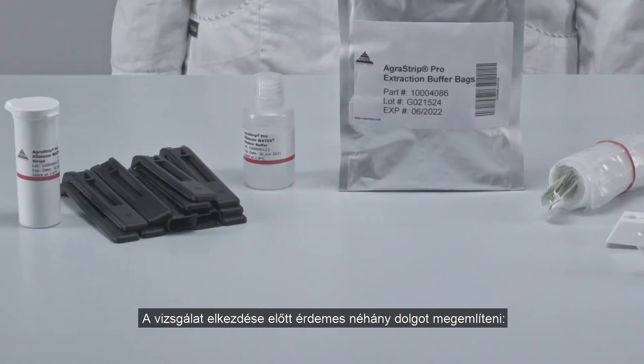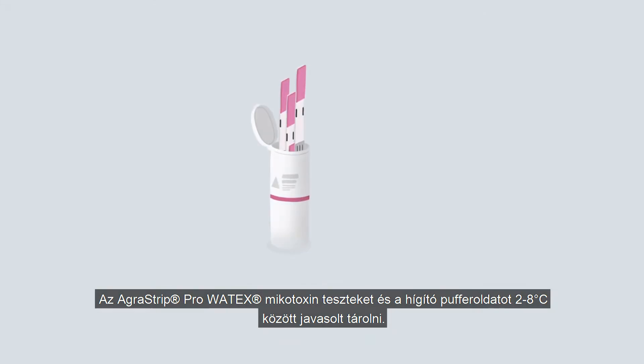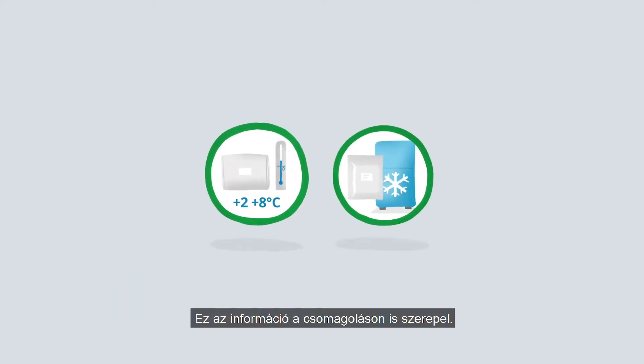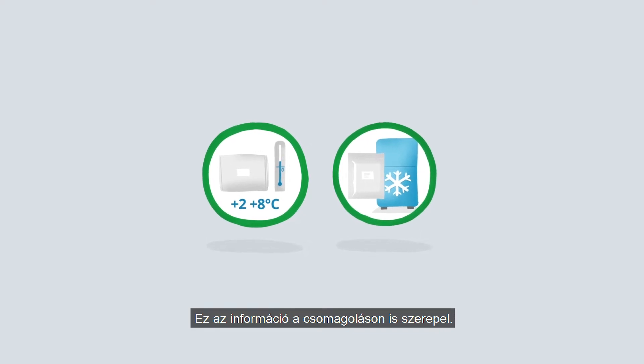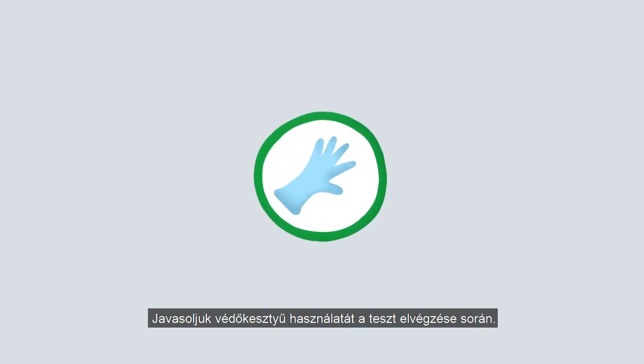Before we start, there are a couple of things worth mentioning. AgraStrip Pro WATEX mycotoxin strips and dilution buffer must be stored at 2 to 8 degrees Celsius. These come packaged for refrigeration in a clearly marked bag. We recommend that you wear protective gloves when performing the test.